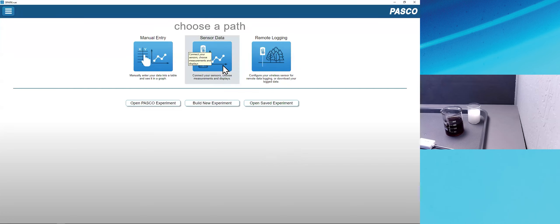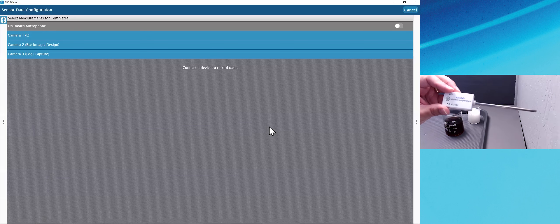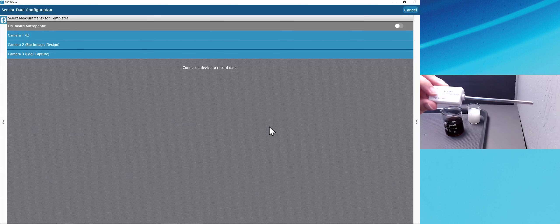Choosing the sensor data path brings us to the sensor data configuration screen. On that screen, we can connect our sensors and choose which measurements we'd like to see and how we'd like to see them. I'm using the white wireless sensor line, so I'm going to go ahead and turn on power to my first wireless temperature sensor.